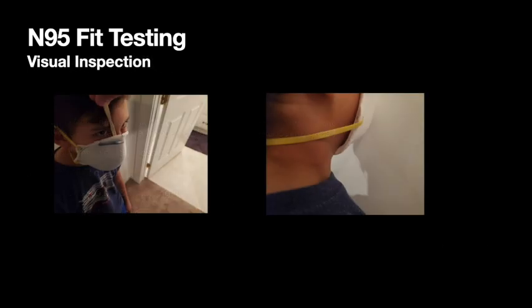Here I'm just showing a few examples of how we check to see if a mask is sized properly before putting anybody underneath the hood. So we take a little coffee stirrer and we poke around the nose, or we look under the chin from behind and we take a look there. As you're using a mask in normal everyday operation, whether you've been fit tested with it or not, you should be able to tell whether or not it's fitting you properly. You should be able to reduce the number of smells that you smell, the odors that you smell on a normal basis. So keep that in mind, before and after fit test, to make sure that your masks are protecting you properly.